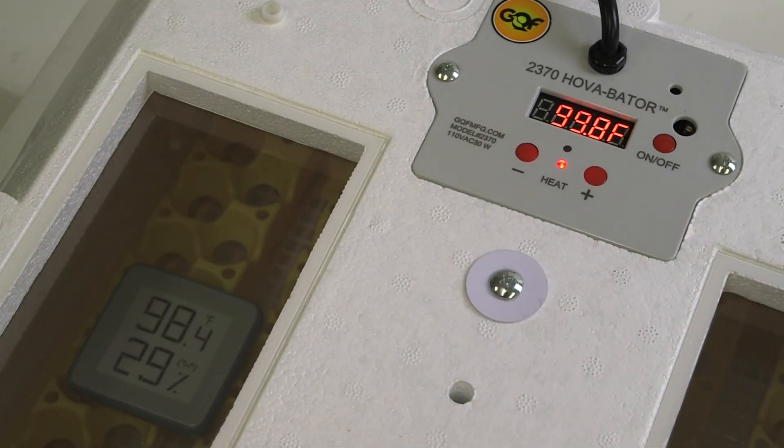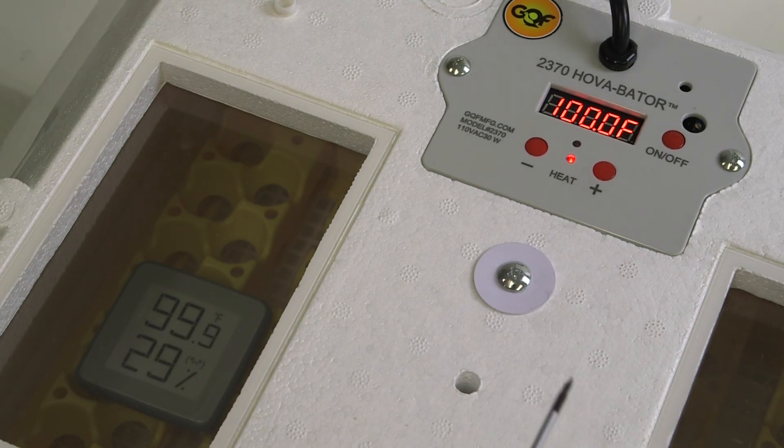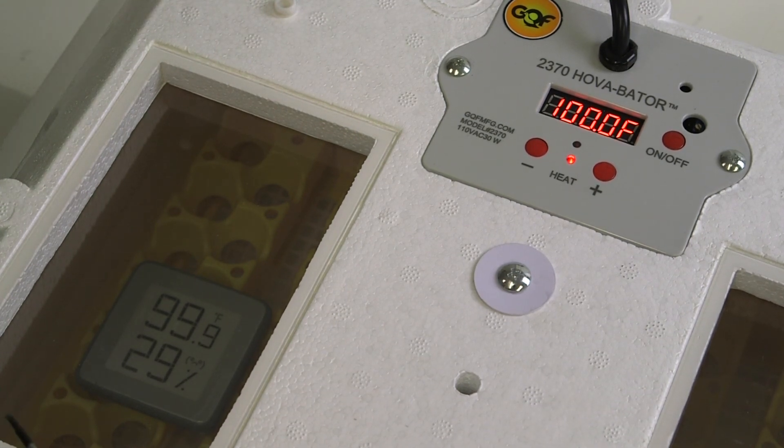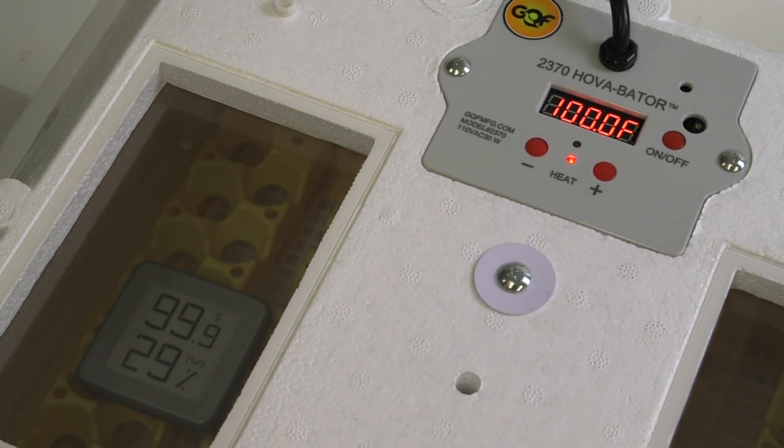After you've adjusted the screw a couple of turns, you need to give it a few minutes to regulate as it adds the temperature to the inside of the incubator. After just a few minutes of the sensor adjusting the temperature, the inside temperature is now 99.9, and the LCD readout is 100 — so you've successfully recalibrated the 2370.